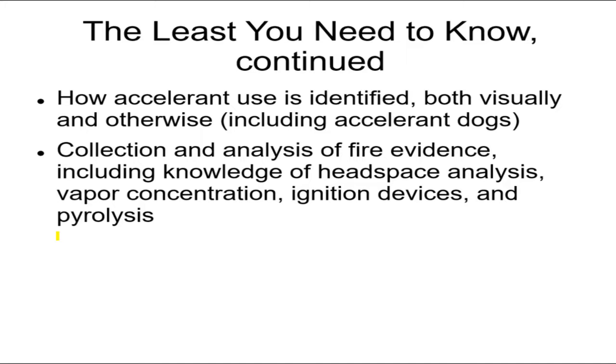It's the same kind of thing. It's when something turns into a gas, we put it through a chromatogram. We just didn't mention the name, but turning it into a gas and sending it through the gas chromatography procedure, that's pyrolysis.